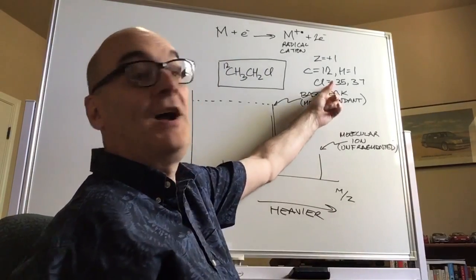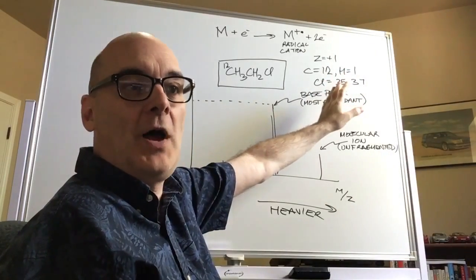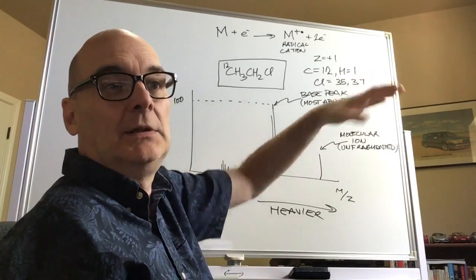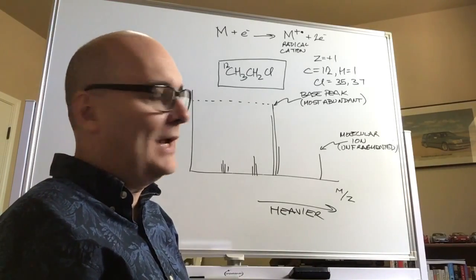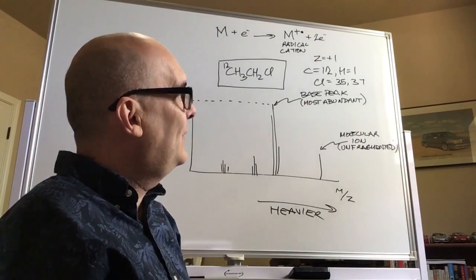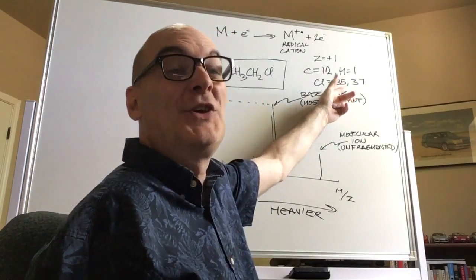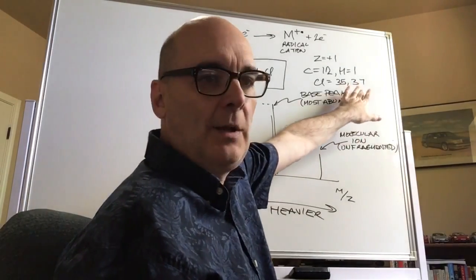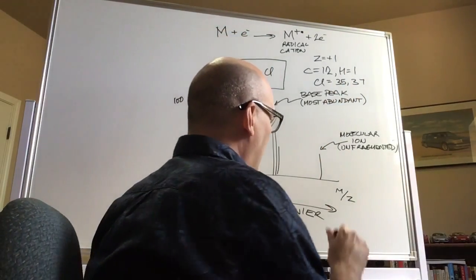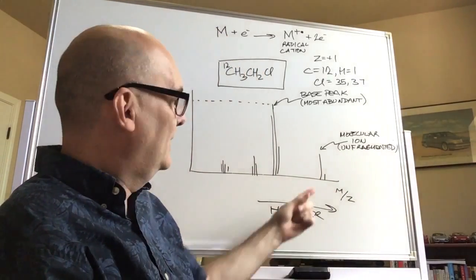With 35 being the most abundant of the two, which is why the atomic mass from the periodic table, which is really a relative mass because it's a weighted average, is 35.45. It's closer to 35 than to 37 because 35 is the more abundant of those two isotopes. But there is a real amount of 37 floating around in the universe. There it is.